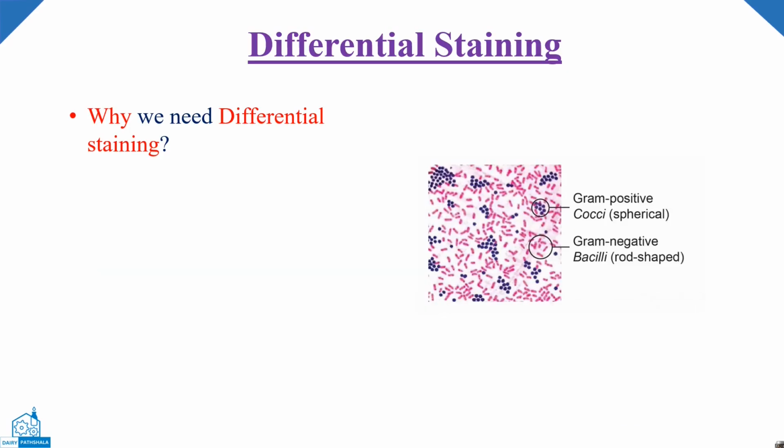Why are we doing differential staining? Because to differentiate gram positive from gram negative, we should do differential staining.